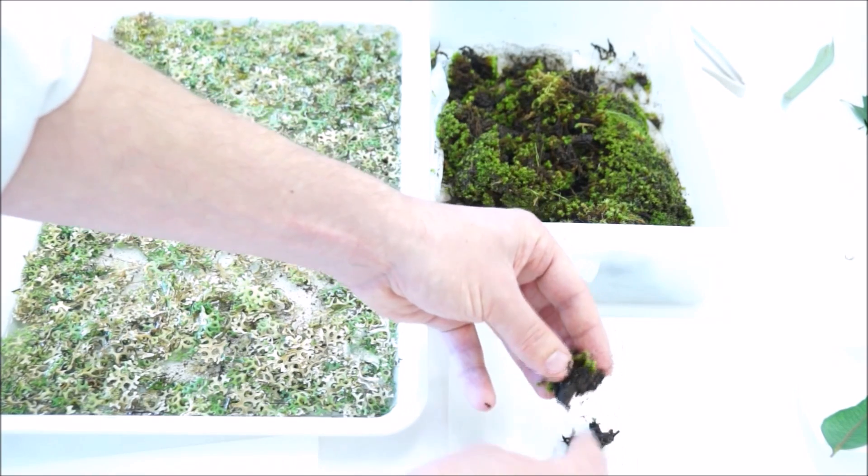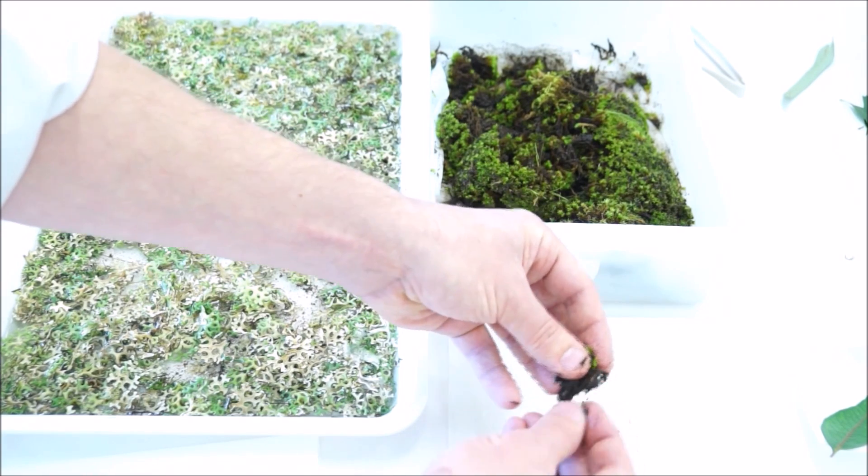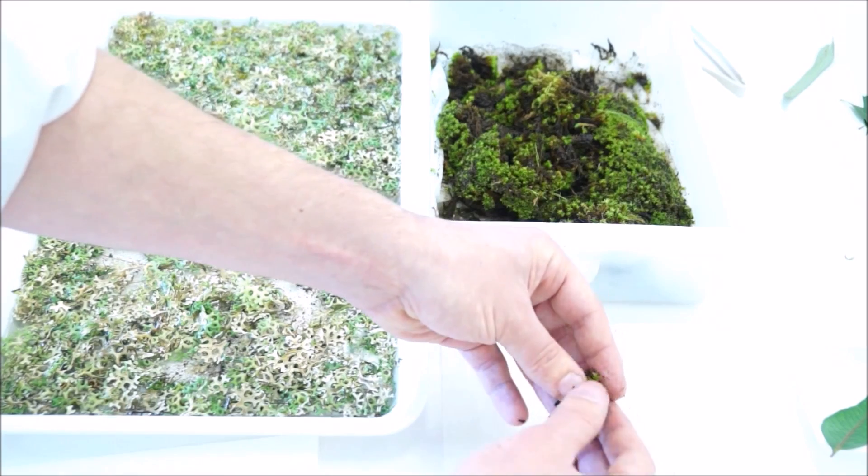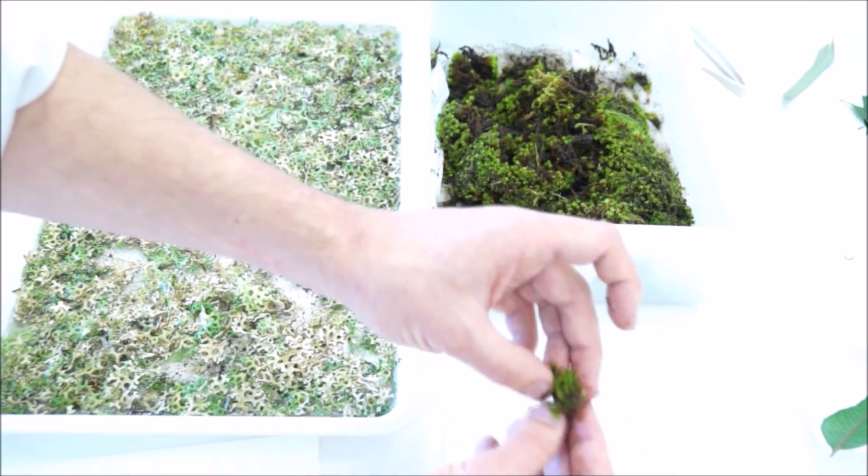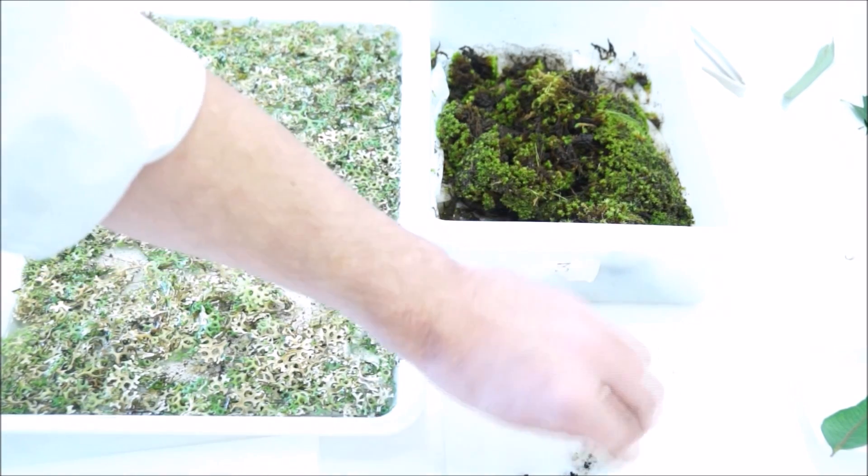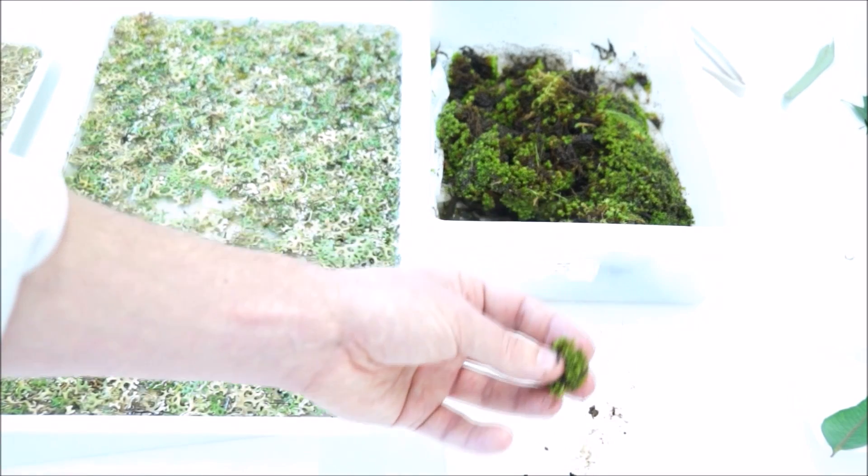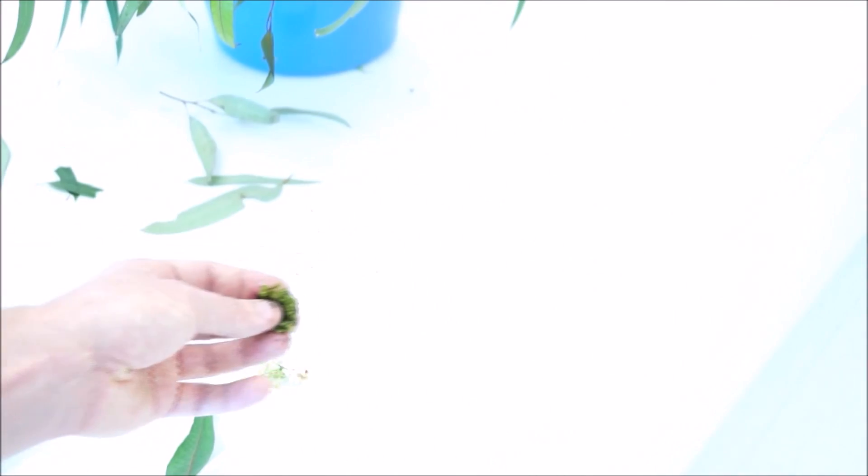You may want to even give it a rinse under the tap, and if you do, remember that you're wetting the outside of the plant, so perhaps give it a blot on the paper. But once you've done that, that's three samples.